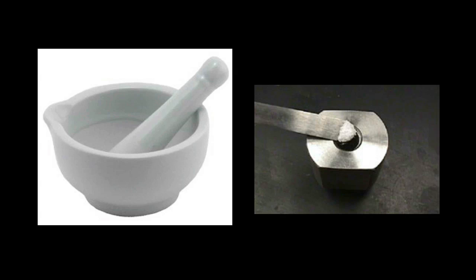You grind it up into a nice powder, then you place the powder, as we're showing here on the right, into a KBr die, and then using two bolts that you squeeze together, KBr is such a soft solid that when you squeeze with enough pressure it will press that KBr into a really clear window looking just like a sodium chloride plate, and in that clear window will be suspended your compound. Again you place the KBr die in an IR beam, you pass the IR beam through it, and because your compound is suspended in the window you will be able to see the IR radiation interact with your molecule suspended in the KBr window.